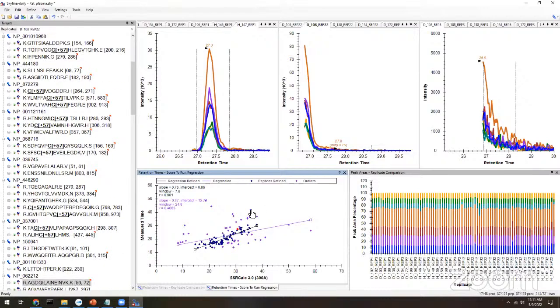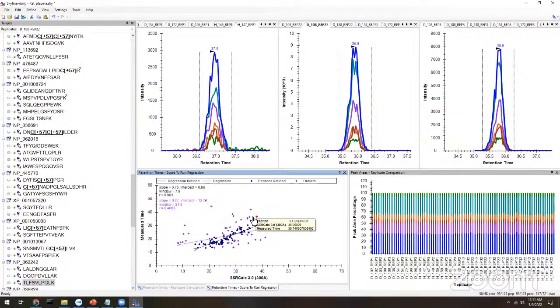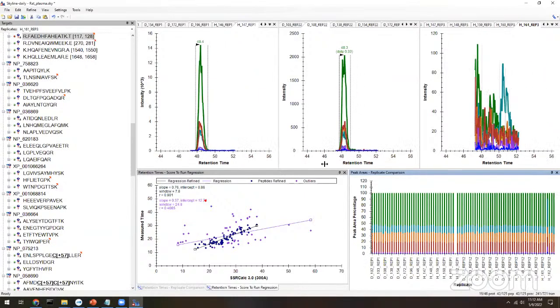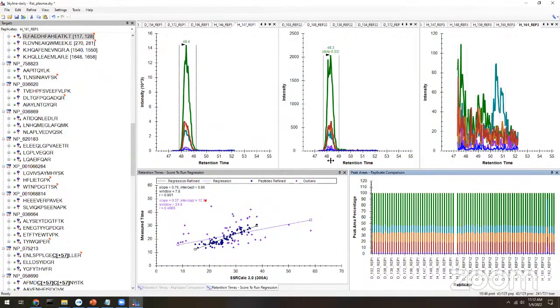The other question that I had is, when you have your peak area percentage and you've got it normalized, it's very easy to tell when you pick the wrong peak. But I see you doing some kind of wizardry where you're able to eliminate those peaks that are not correct, and you're able to get all of the samples to align at the correct retention time. So how are you doing it, where the ones that are wrong, you're just aligning all of them to the correct retention time, so it's so easy to find that peak?